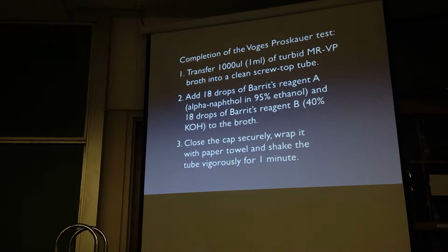Instead, what you have to do is take 1,000 microliters of your culture out of the tube that it's currently in and put it in a screw top tube. How did you guys measure 1,000 microliters the last time you did this? With a pipette and a bulb. It was a lot of fun, right? No, nobody liked that. The good news is, for today's exercise, I'm not going to ask you to do that.